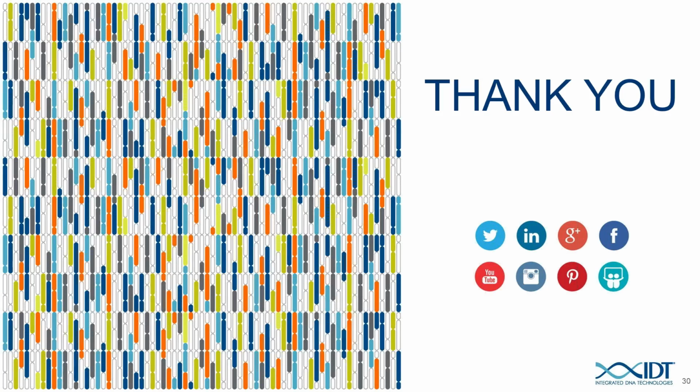So that complete Cas9 RNP, once that complex is prepared, it's actually quite stable. We've done a number of tests with freeze-thaw cycles and dilution of these RNPs and found that it can actually last for quite a while. So that's one convenient thing for preparing your experiments: you can prepare the full RNP and keep it in the refrigerator for easily up to a week at a time so that you don't have to worry about scrambling on the day of an experiment to get all these things ready.